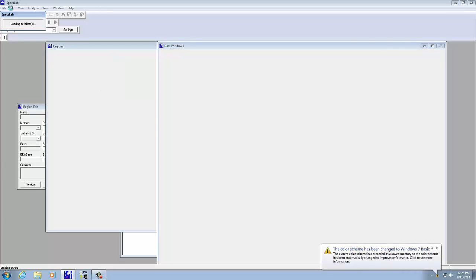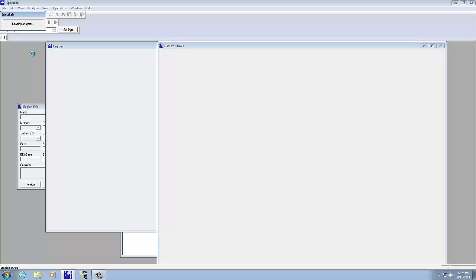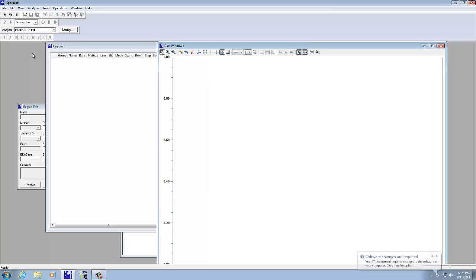What we should notice is that the serializers are loading here. When you're loading the software, notice over on the detector there's a green flashing light. That should be flashing when you first turn on the power supply, but then when the analyzer connects, that should go to solid green.